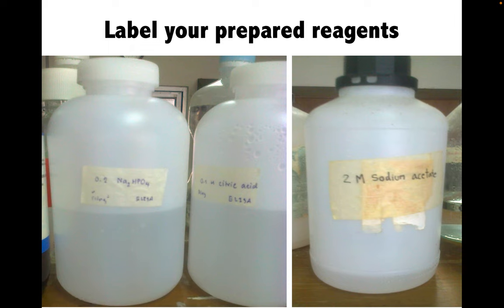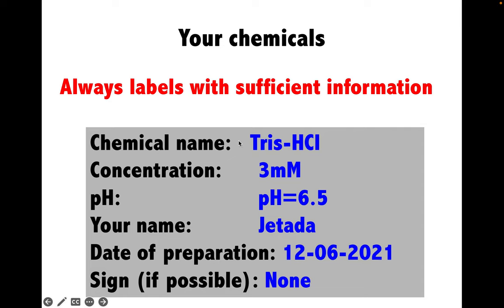Another common issue in laboratories worldwide is the labelling of prepared reagents. You might normally write only brief details like '2 molar sodium acetate' — but is this enough? Definitely not. Here are the full details recommended for labelling: chemical name, concentration, pH, who prepared it and when it was prepared, and any relevant hazard signs or symbols.